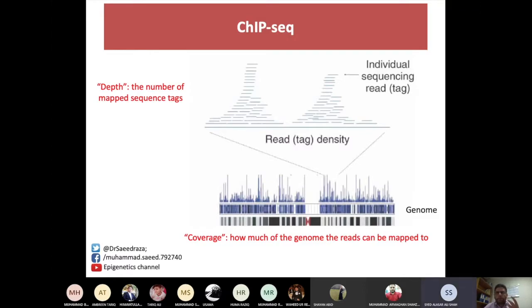These are meant to amplify anything which is present. So these are synthetically made. I mean, what is the probability of getting AAAGGG? So this is just a normal tag. You could use that and it will amplify everything which is present in your genome of interest. So these are normal random adapters. It has nothing to do with any specific thing.